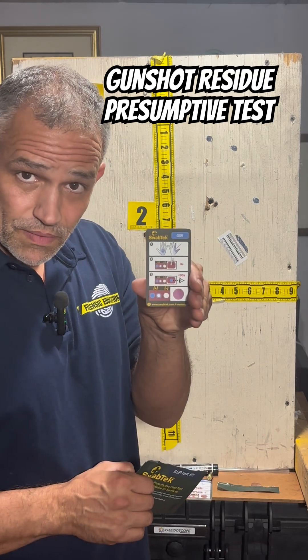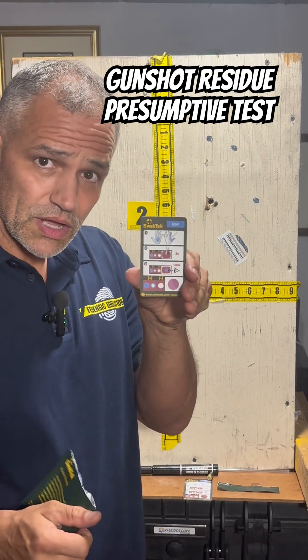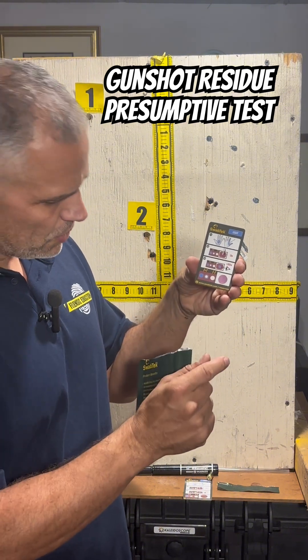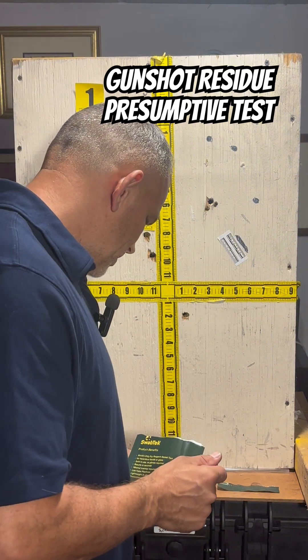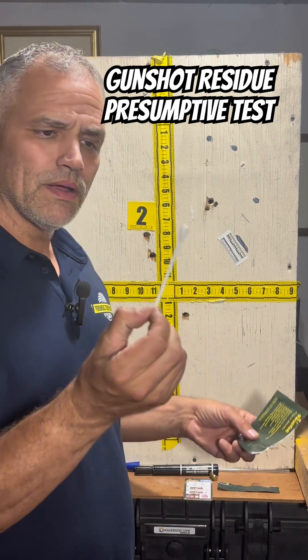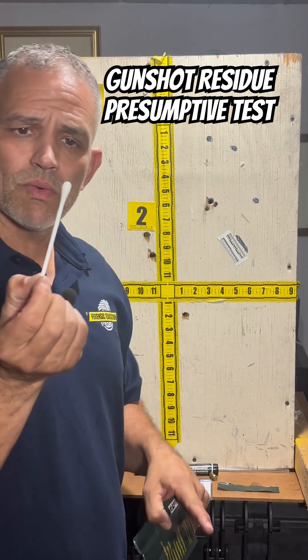You have a card here and you see right up top, it says gunshot residue. It has the instructions on how to do it, and then this is where we're going to put our sample. I'm going to take out this swab — this is a moistened swab already.